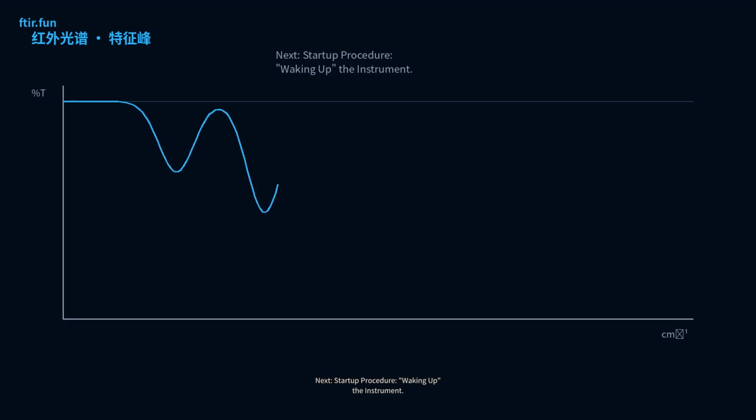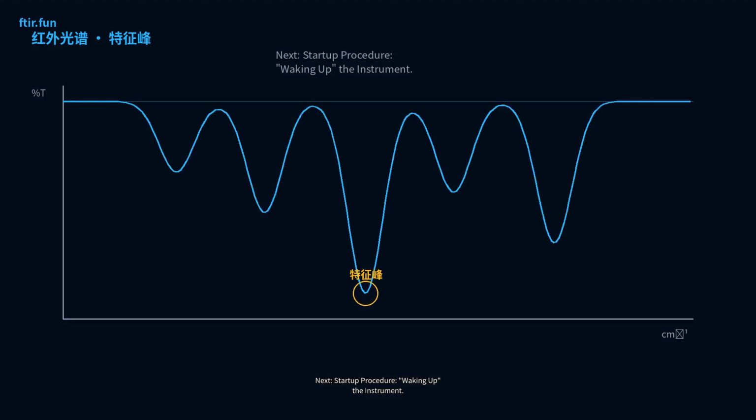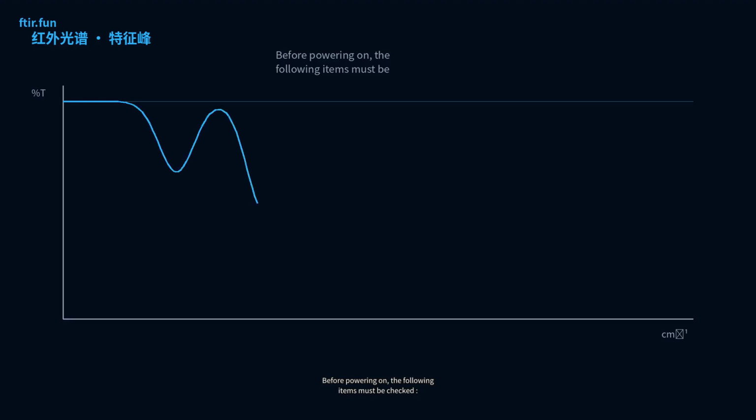Next, startup procedure: waking up the instrument. Startup is not just pressing the power button. Before powering on, the following items must be checked.